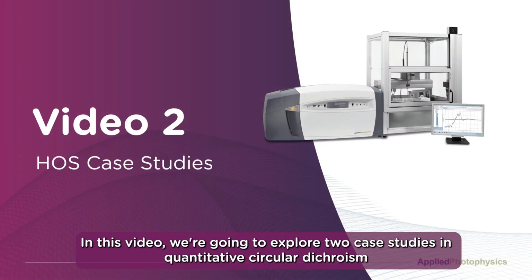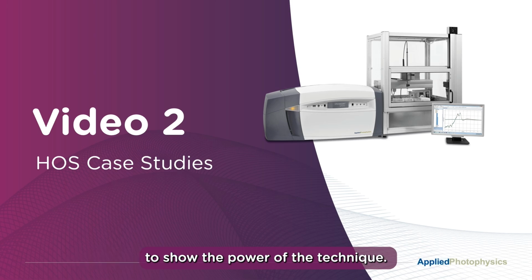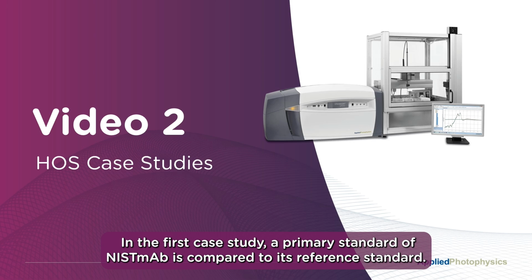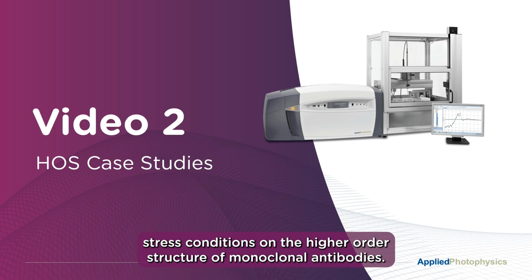In this video, we're going to explore two case studies in quantitative circular dichroism higher order structure analysis as representative examples to show the power of the technique. In the first case study, a primary standard of NISTmAb is compared to its reference standard. The second case study illustrates the effect of forced degradation stress conditions on the higher order structure of monoclonal antibodies.